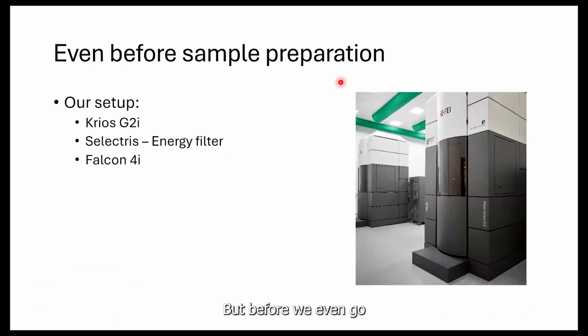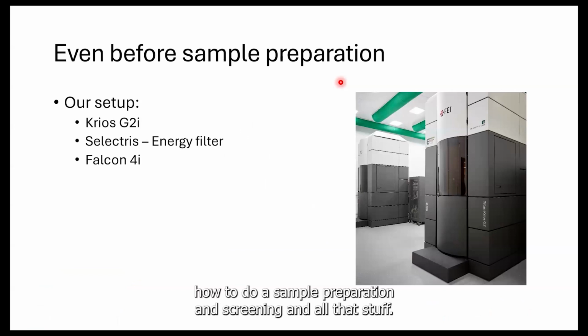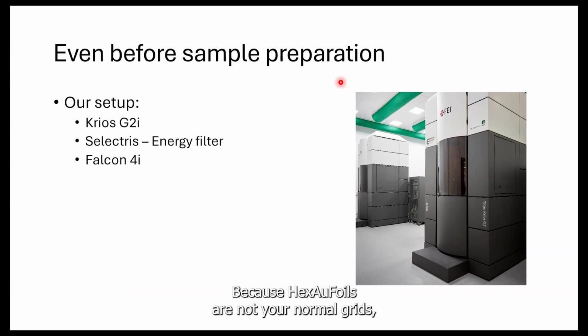But before we go into how to do sample preparation and screening, there are some things we in our facility recommend other users in other facilities to make sure their facilities have, to make sure it will work properly, collect data properly, and your life will be easier, because HexAuFoils are not your normal grids.